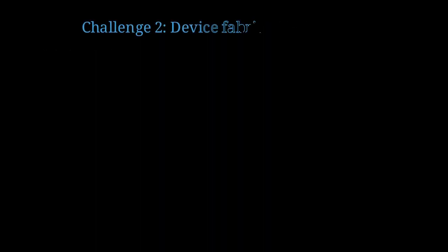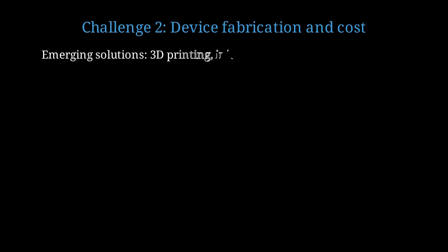The second challenge is device fabrication. Most microfluidic devices are made using soft lithography with PDMS, which is time-consuming and requires clean room facilities. Emerging solutions include 3D printing of microfluidic devices and injection molding for mass production. These approaches dramatically reduce cost and fabrication time.